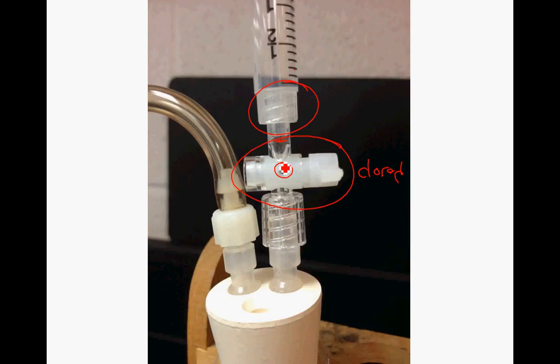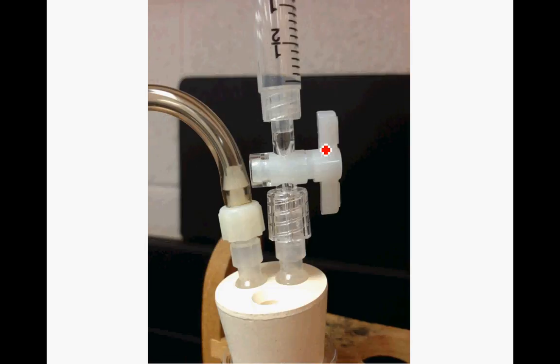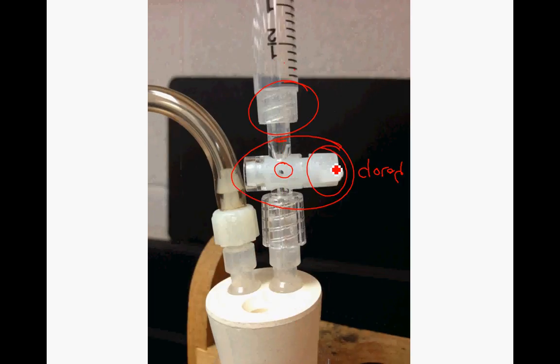Right? So what you do then is once you get your substrate in there, you're going to open the stopcock valve here. Right? And so there it is in the open position. And you can see that you cannot see that hole there because that hole is in line with the substrate. So you'd be able then to squeeze the substrate down into the test tube down there. After you squeeze that or put that substrate in there, then you're going to go back and you're going to close this valve, right, as the reaction happens. Right? So you want to go back to that position.